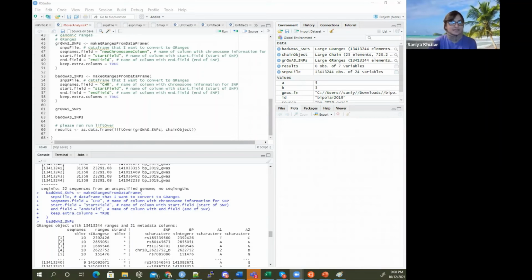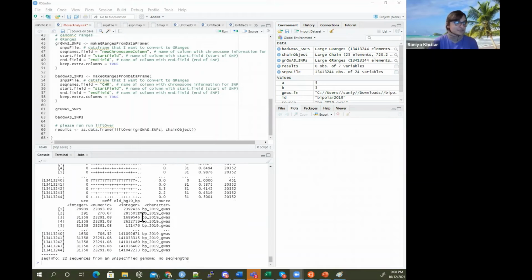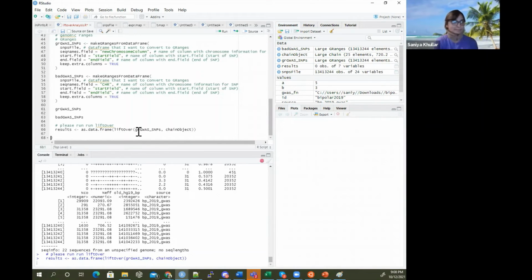So instead, what we're going to do is try this with this GWAS. I just want to show it because you might forget, and I want to show you what happens. It's not me trying to show you a bunch of rules. You might have a little panic like me. I'm like, why isn't this working? Am I doing something wrong? Am I breaking it? And then I'm like, oh, wait, I forgot CHR. I didn't really think it would be that sensitive.